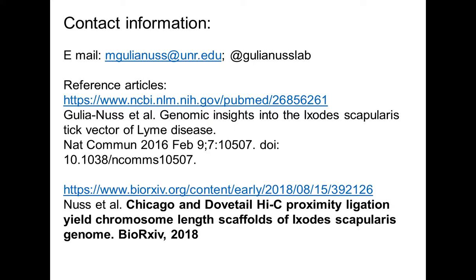But there are basically 4 challenges at the draft de novo stage. When we're building an assembly for our clients, the main challenges are heterozygosity, genome size, repeat content, and ploidy. Often we can't control those, right? The only thing we can really potentially minimize is heterozygosity, and we have various recommendations regarding that.